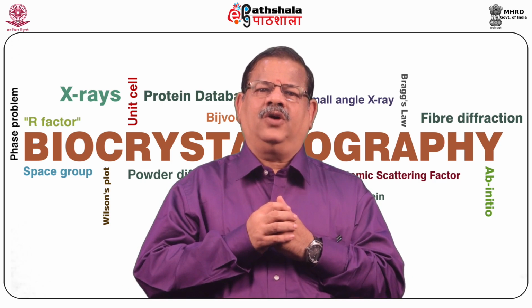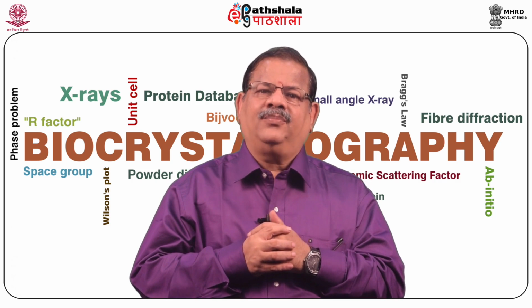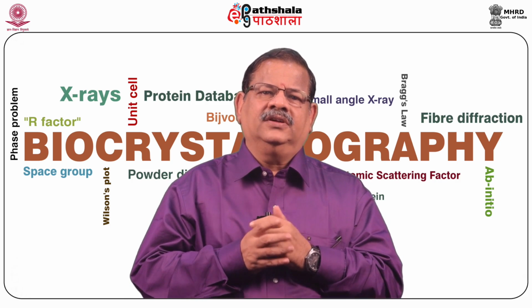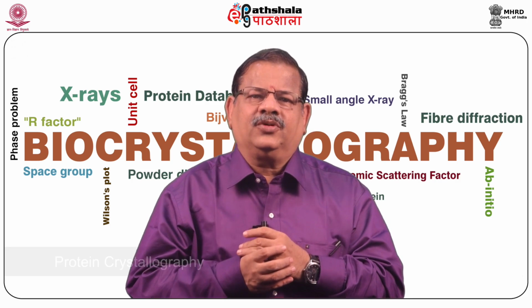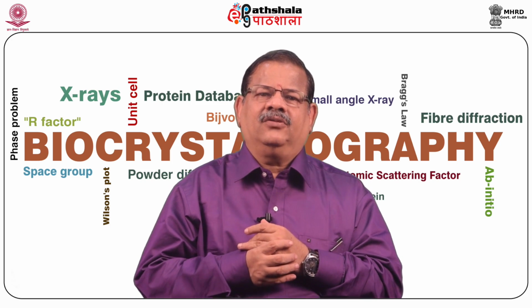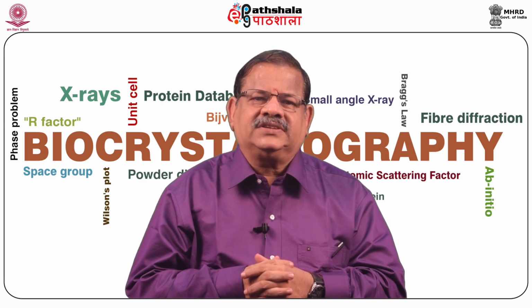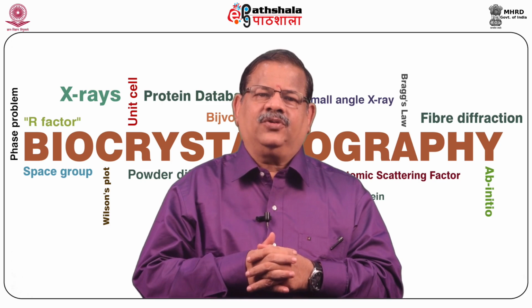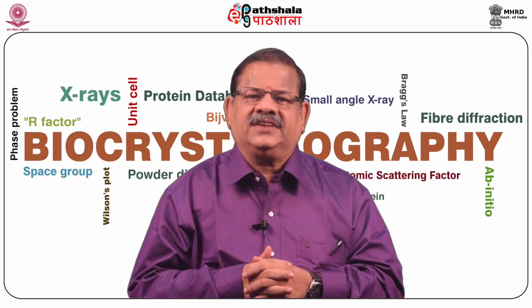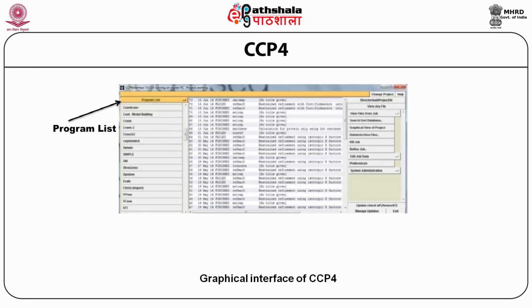Extensive details can be found about the program suite from the following reference and website: Collaborative Computational Project number 4, 1994, the CCP4 suite Programs for Protein Crystallography, which was published in Acta Crystallographica section D 50, page 760 to 763. The website is http://www.ccp4.ac.uk/dis/html/index.html.